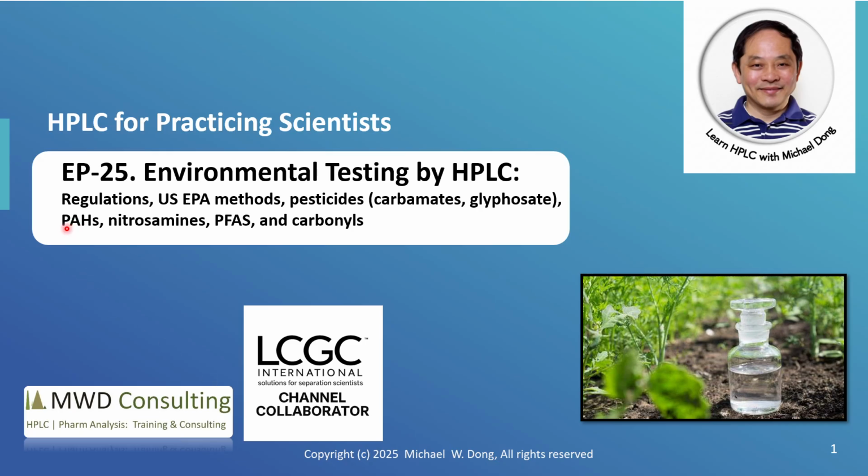Here we will cover some regulations, many United States EPA methods on various substances such as pesticides, PAHs, nitrosamine, PFAS, and also carbonyl. This particular topic is particularly dear to my heart because I started my career many years ago as an environmental chemist in analytical chemistry.